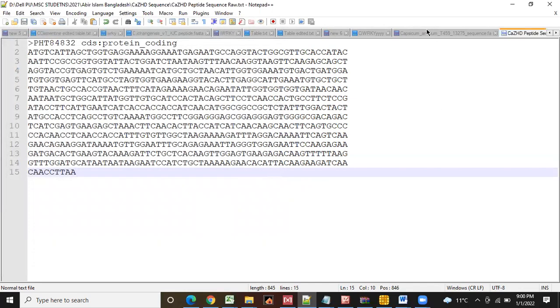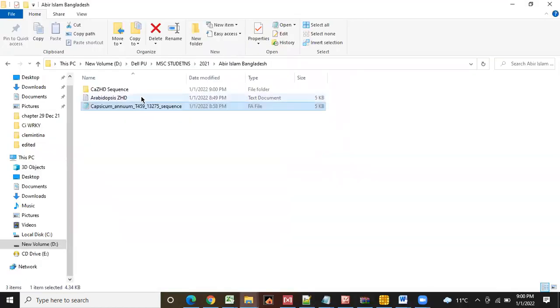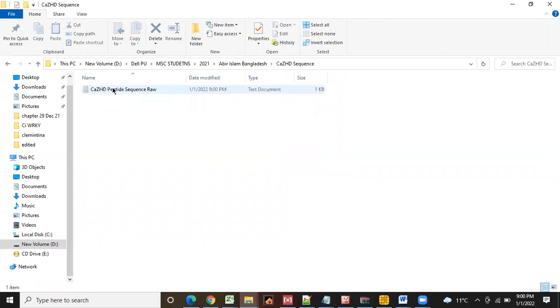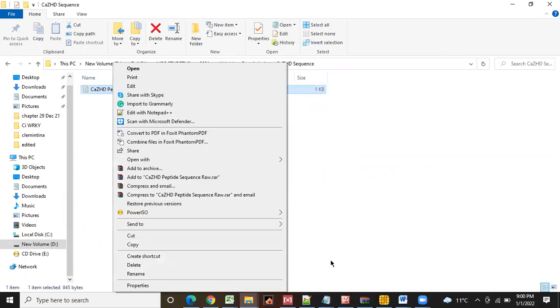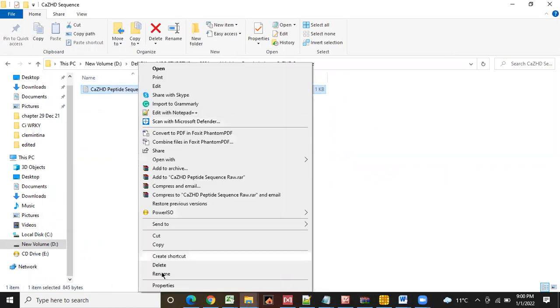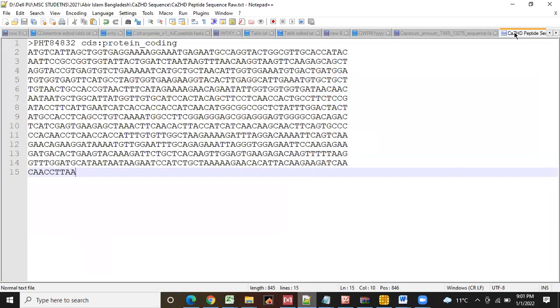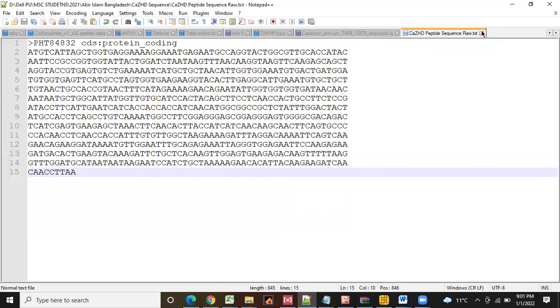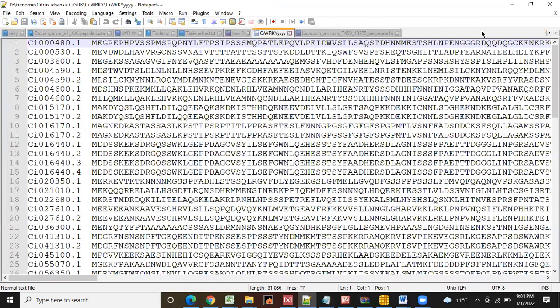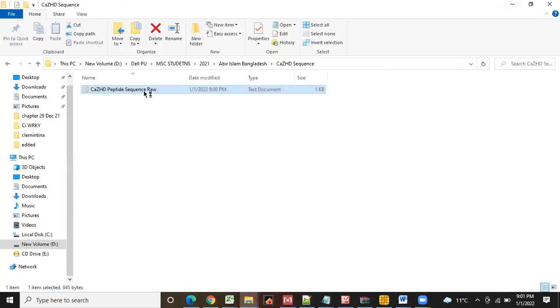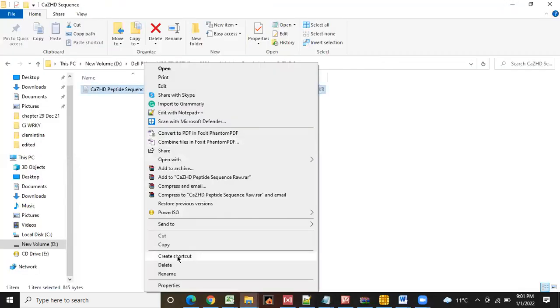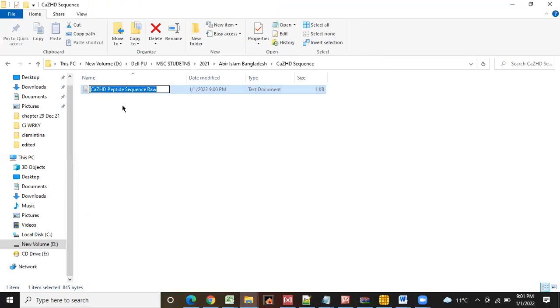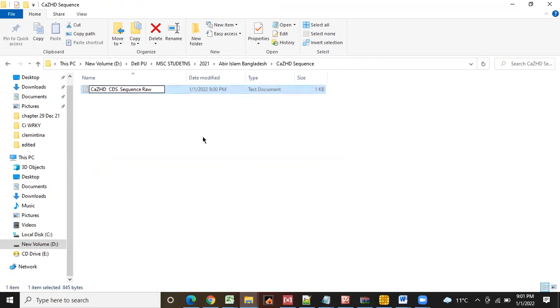Similarly, you will go to - it's not a peptide, sorry, it's a CDS. It is a CDS. We will rename that. It's a CDS file, not a peptide file. CDS. Similarly.